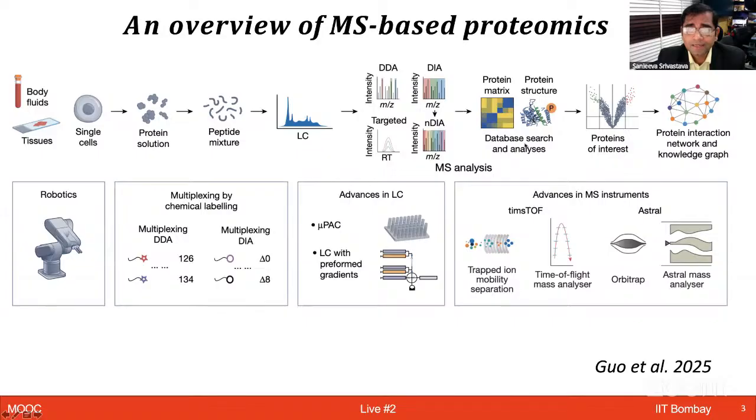Finally, then in this data, what comes forward is you get the heat maps and the various ways of principal component analysis to find out how well your control and treatment can be differentiated, as you can see in this type of plots. In the volcano plot, you can see the proteins which are passing the threshold, which are extremely up or down, and significantly passing the threshold. Those will be considered forward for your network analysis and the interaction analysis likewise.